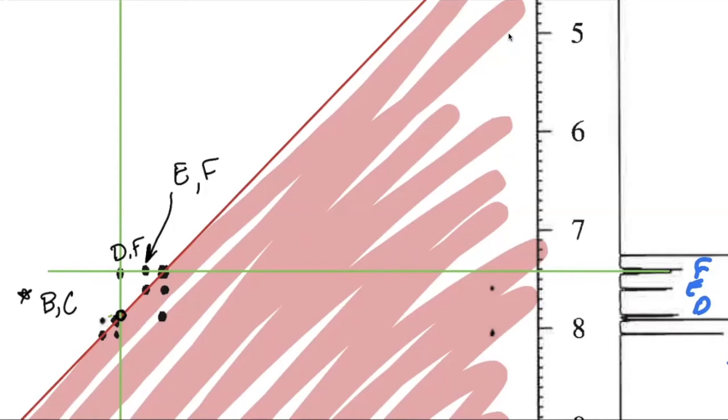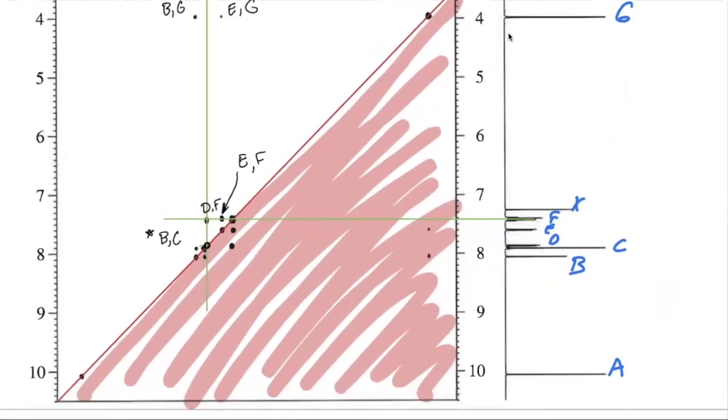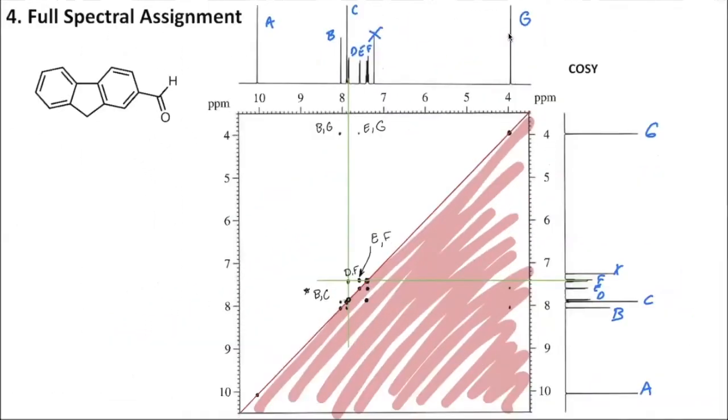But this is what you should do if you're having a little bit of trouble deciphering: is that C, is it D? If they're close together, do whatever you can using a computer or tablet. If you need to print these out, just zoom them in using anything like PowerPoint, Microsoft Word, or Google programs to make the image bigger and really zoom in on some of these small, fine-grained detail pieces. I apologize that we can't make the resolution any better, but at least you'll be able to see a little more carefully than if you had this zoomed all the way out. So I'm going to zoom back all the way out now and get us centered back on our page.